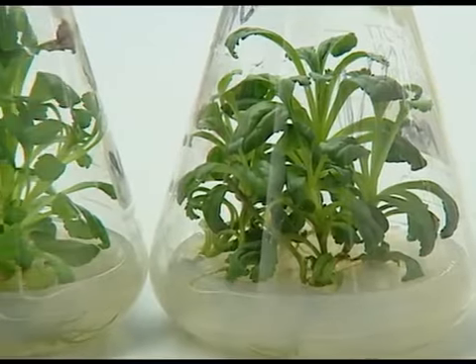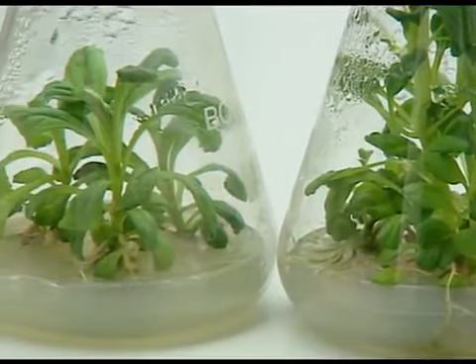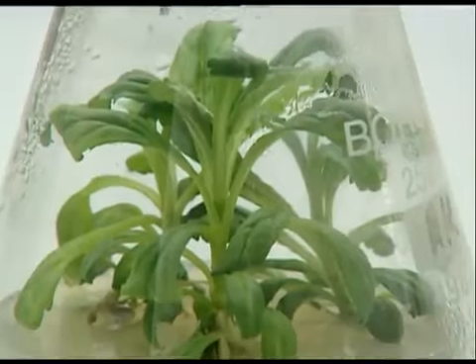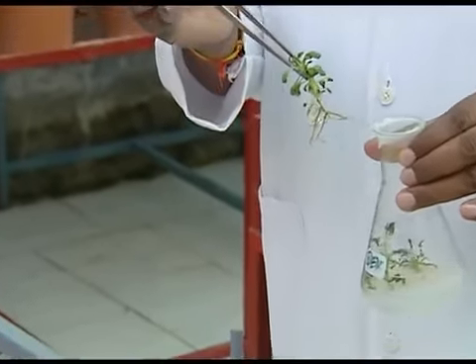Generally, auxins are used in the culture medium to induce rooting in each of these shoots. Once the shoots are rooted, these have to be hardened for acclimatization in the open.